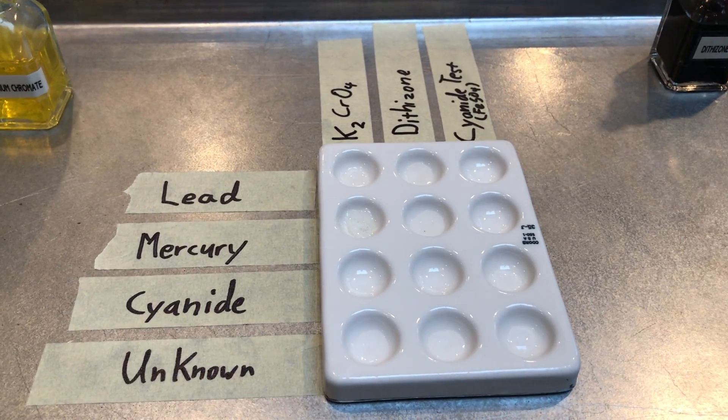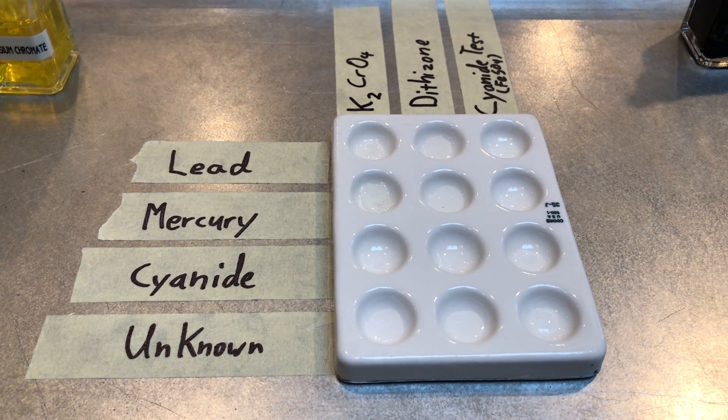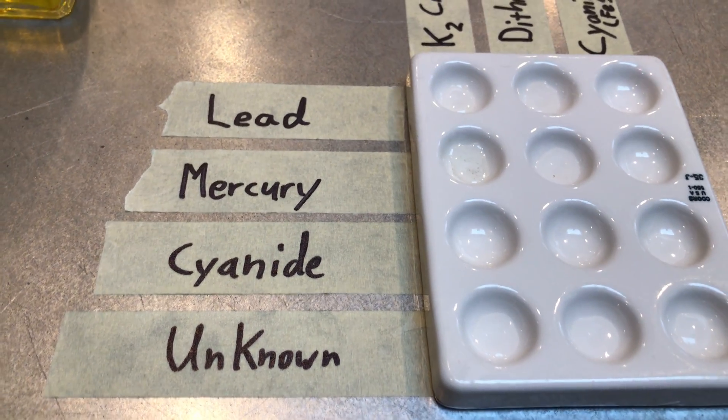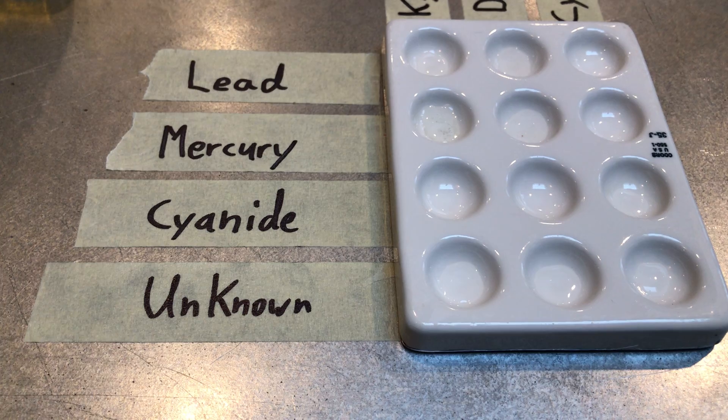Hey ladies and gents, we are going to be doing our testing of inorganic poisons portion of our lab now. We are testing three known poisons: lead, mercury, and cyanide against an unknown to determine what our unknown is most similar to.